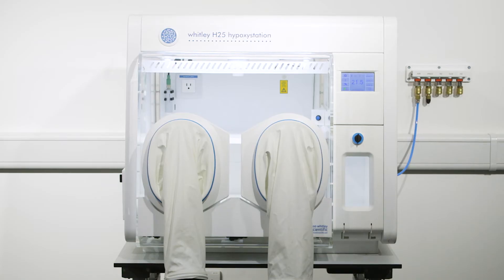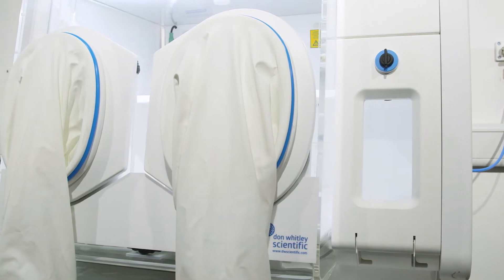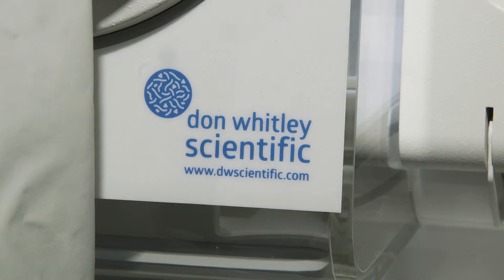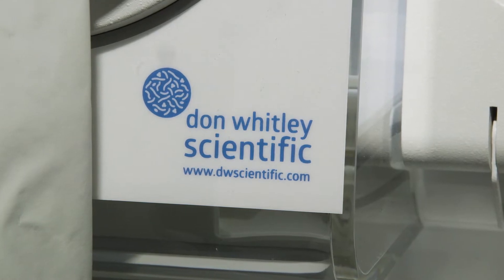Its compact size saves bench space and the new style glove ports maximize the working area available. This hypoxie station also provides stable conditions and low gas consumption.